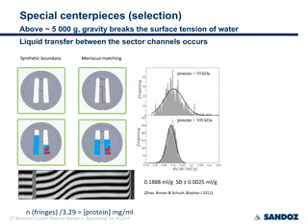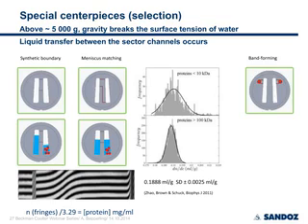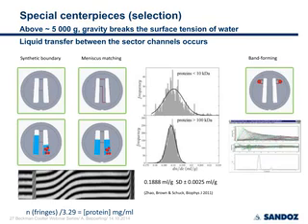Okay, there's also a band-forming centerpiece available. If you have a precious sample, you may layer it on top of your protein solution column, and have a look at the migrating band which migrates through the cell. Or you may want to have a look in an equilibrium experiment where your molecules are located in a density gradient, giving you an idea, for example, if you have free DNA or free RNA in your sample.